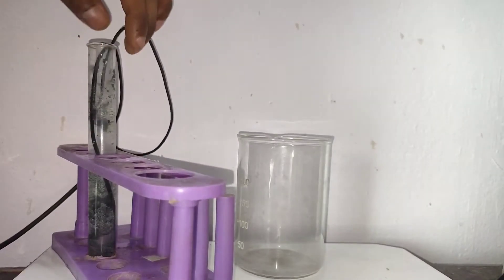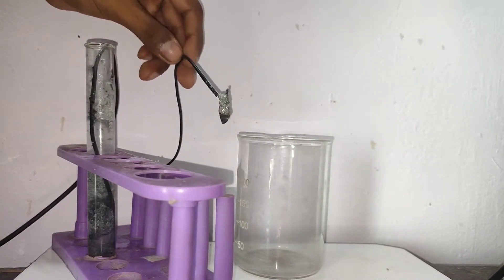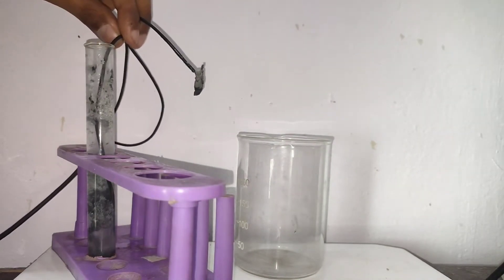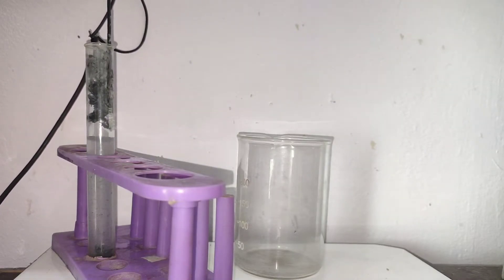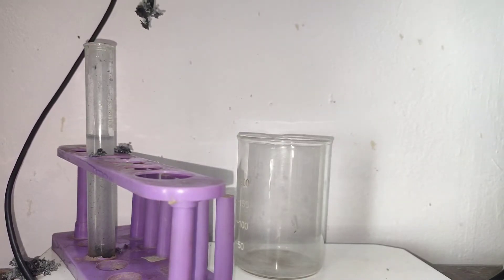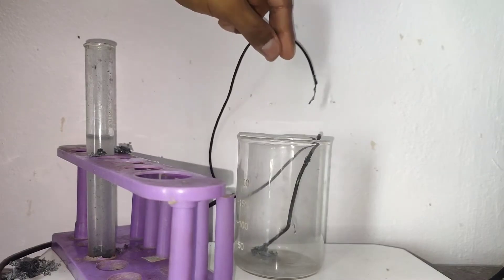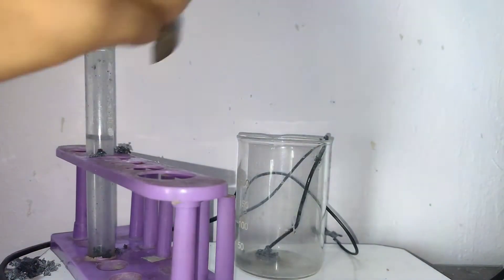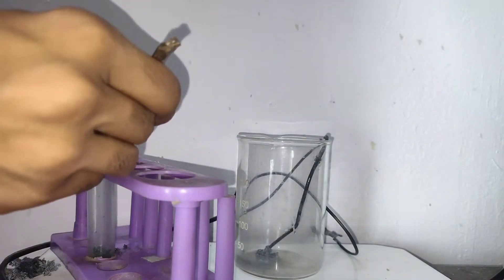First I took out the anode — you can see that the anode has been disintegrated. Then I took out the crystals and as they came out they all fell outside. I picked them up with a spatula and dropped them into the beaker.